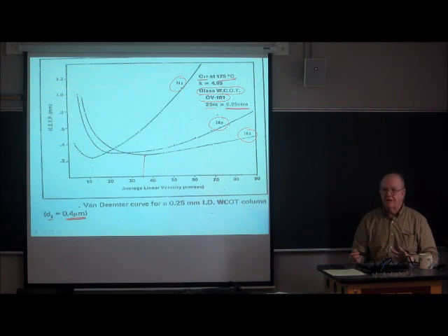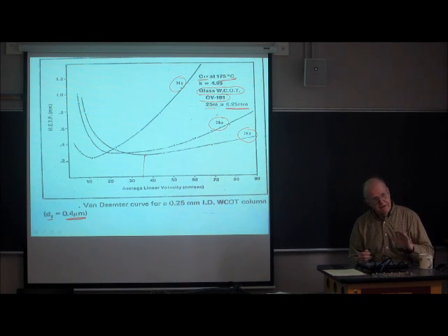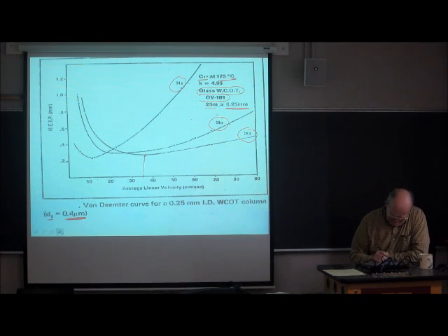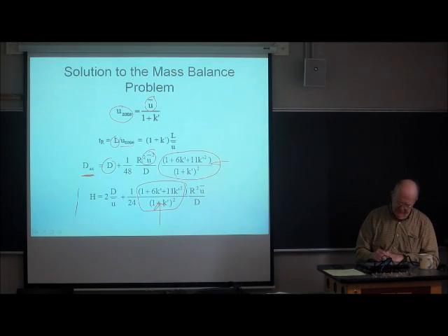Nitrogen, clearly, forget about it. And this is the way people do things nowadays, they use hydrogen, especially since helium is getting more expensive. The hydrogen is not a serious safety concern unless you break the tank open. The flows of hydrogen here are extremely low. I've not heard of a GC blowing up. I'm not saying it can't happen, but okay, back to this equation.